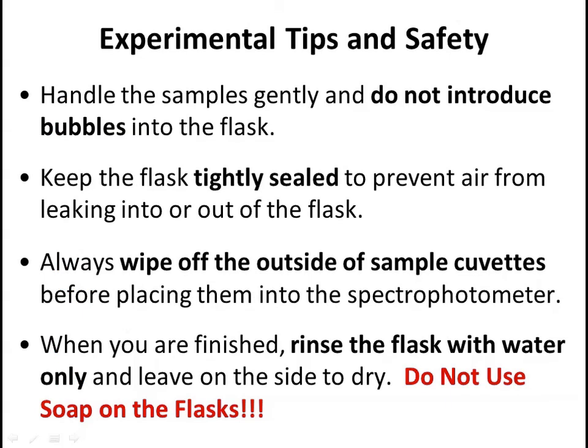And this slide shows some experimental tips and safety issues for this lab. Handle the samples gently and be careful not to introduce bubbles into the flask. Bubbles in the sample will affect your measurements on the spectrophotometer. Keep the flask tightly sealed to prevent air from leaking into or out of the flask.